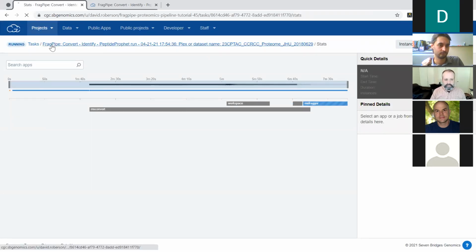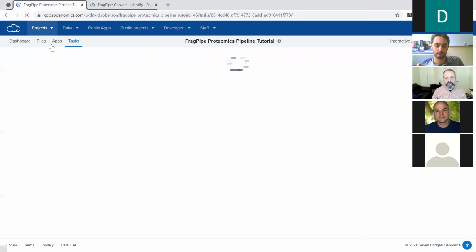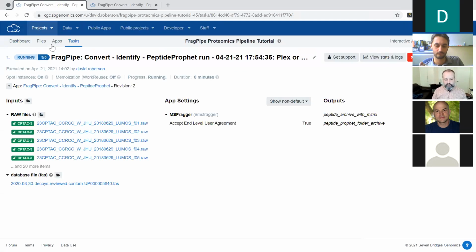Okay, so enough about that. So let's go ahead and everyone launch. Let me do a time check here. I'm going to pivot. Let's run Protein Prophet and talk about that, since we're talking a lot about workflows now, and then we'll talk about launching Data Cruncher, and then demonstrate the Proteomics Data Commons import. So let's run another workflow because it's pretty easy to do.